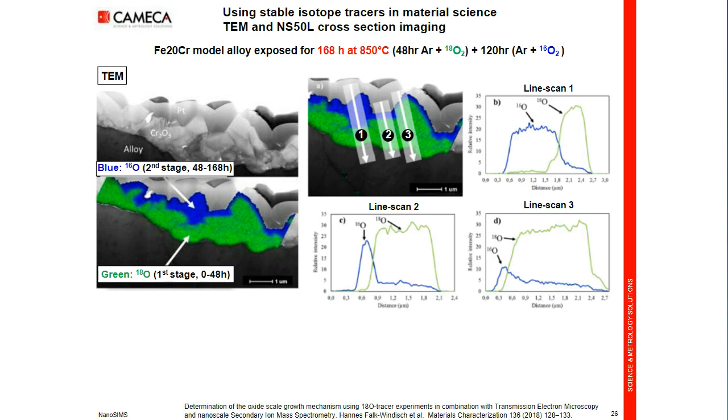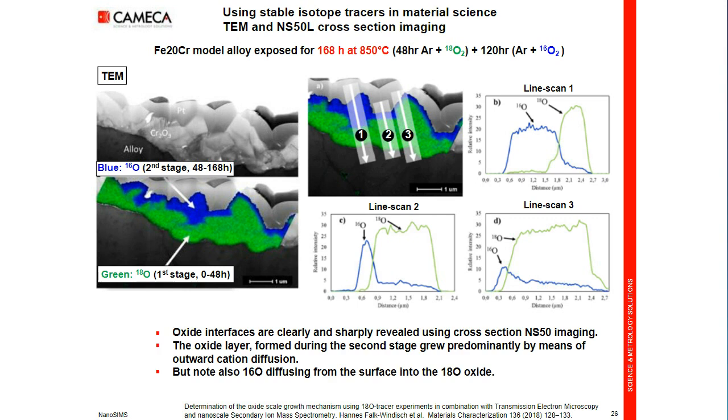And here you can see the different layers with the interdiffusion of the elements, oxygen-18 in green, oxygen-16 in blue, and the depth resolution is given here by the cesium primary beam diameter, around 50, 100 nanometers. So good depth resolution despite a huge topography.